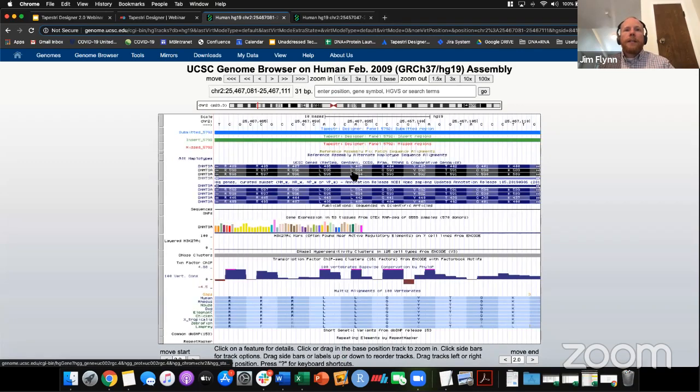zoom in so everybody can see. You can see based on different transcripts, now I have a leucine at site 405, but it's actually called 594 in another transcript model. So just be sure that you're covering the right ones, or you design amplicons to cover both sites at L405, so you can capture any mutations that may result in a change in the protein of that gene.